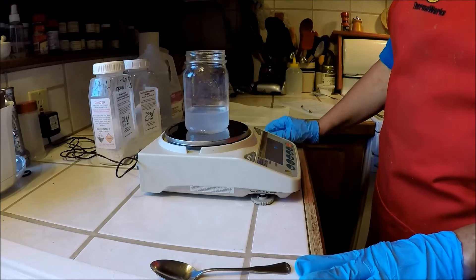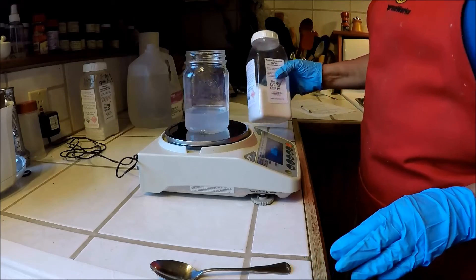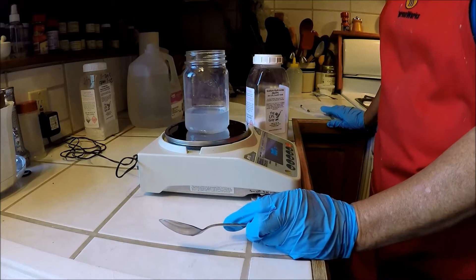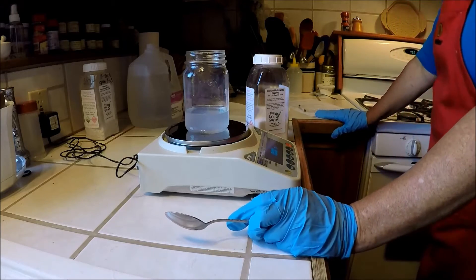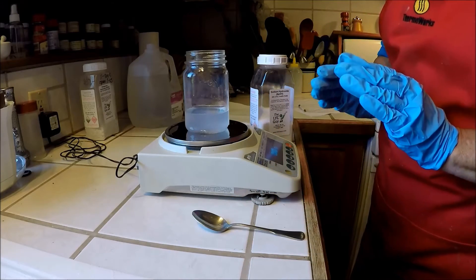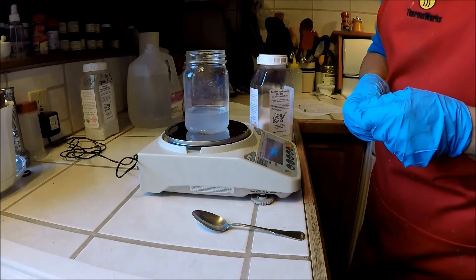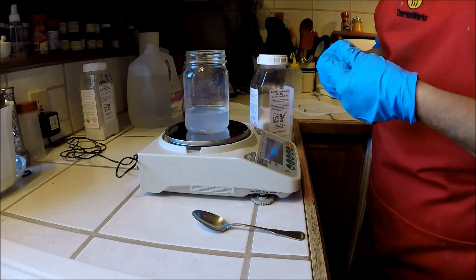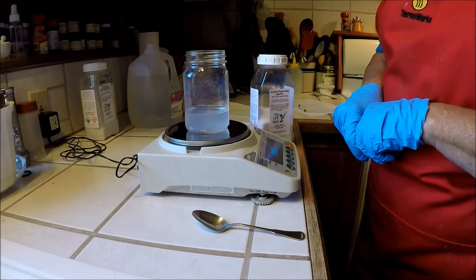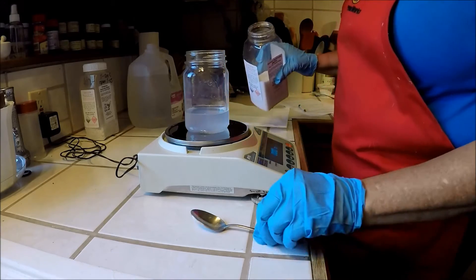Now I'm going to tare or zero my scale again. In this particular case, since most people use sodium hydroxide, I'm going to use the solid sodium hydroxide from this jar. I happen to know from some of the information I have that I need to add about 6.2 grams of sodium hydroxide. Then I need to slow down because I'm going to edge up and add just a tiny little bit of sodium hydroxide, swirl and check, a little bit more, swirl and check, until I get this solution to turn barely pink — not a lot pink, just a little bit pink.